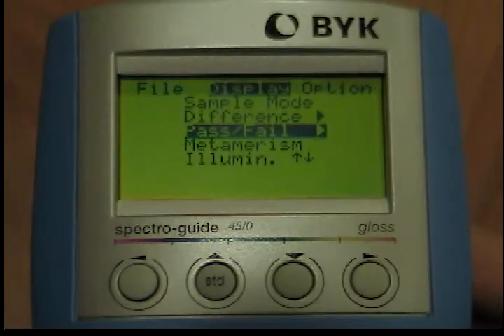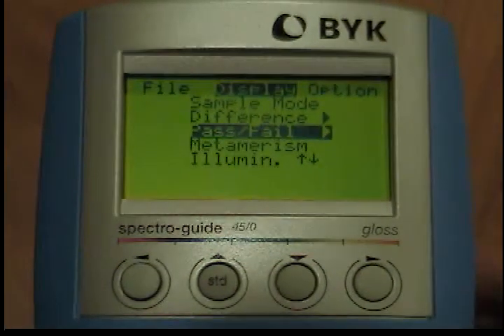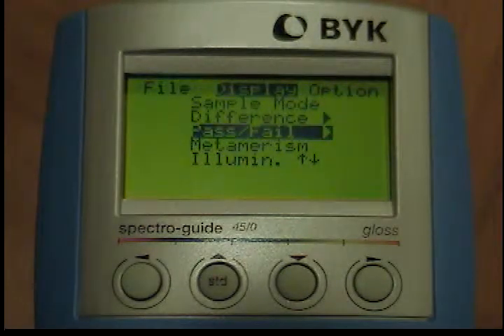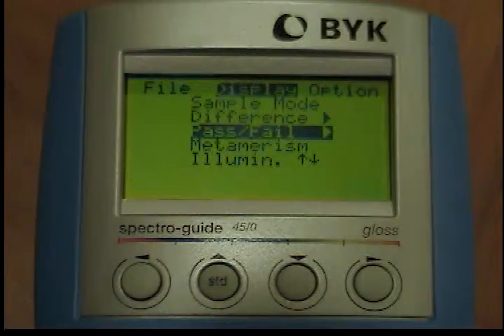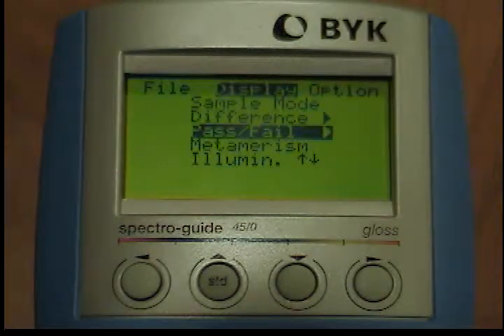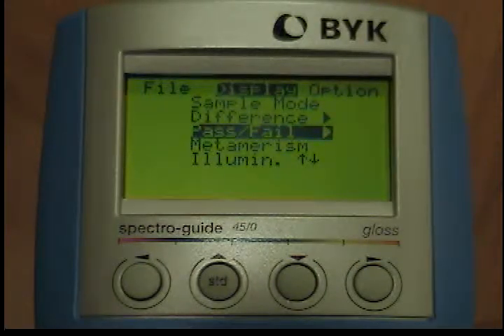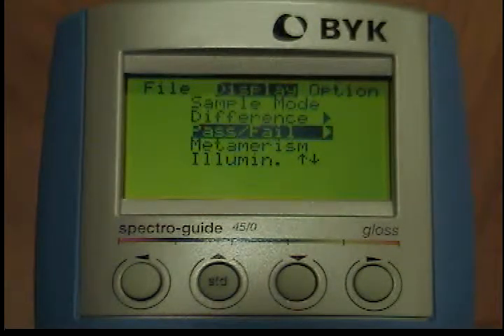The bottom line will show the names of the open sample with respect to the open standard. A beep will also sound if the result is fail. If you would like to change the tolerances for a standard, you must first open this standard and then store it again under the same name. The input screen for the tolerances will then appear. You can change these tolerances, then store the standard with the operate button.